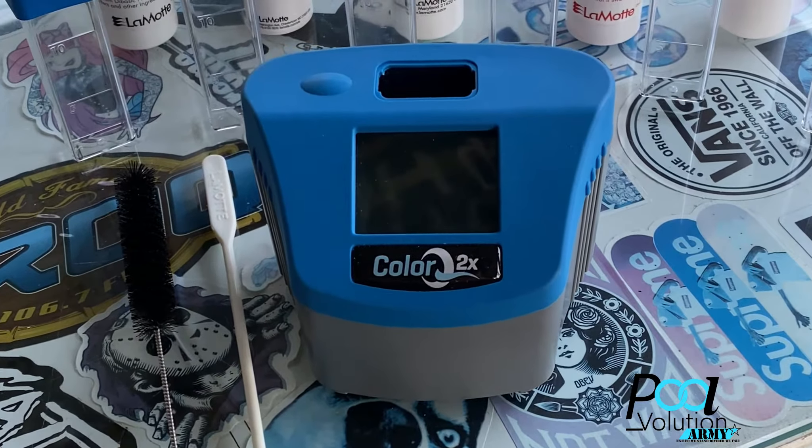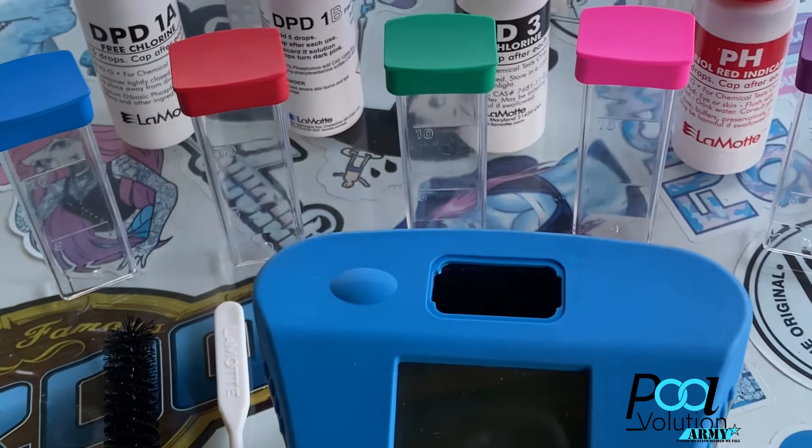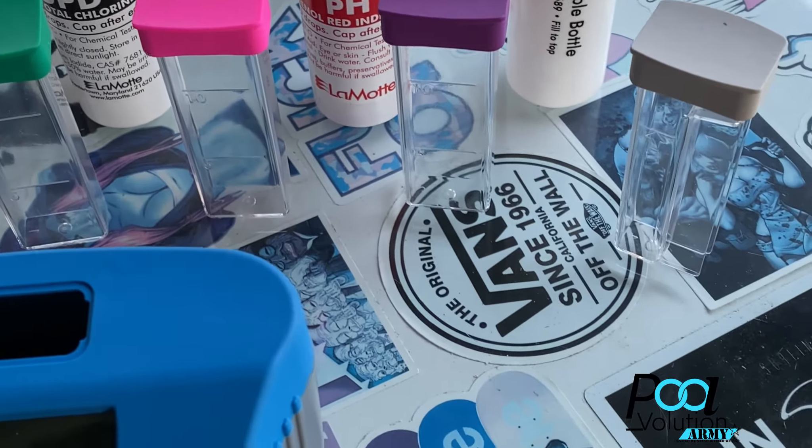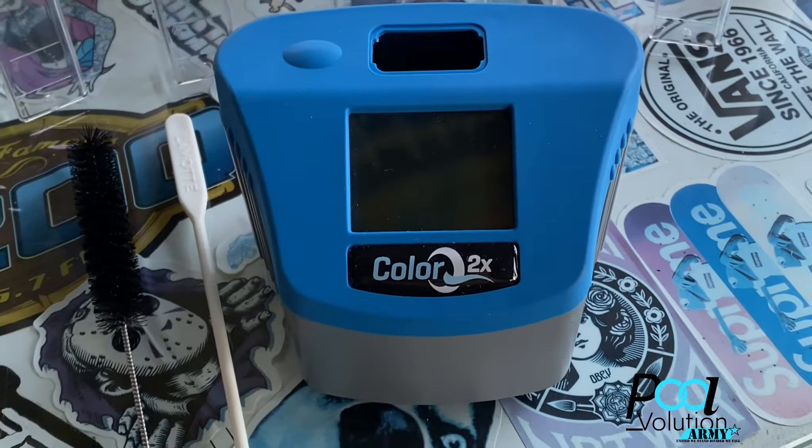What you get is some tablets, some reagents, some vials, a brush to clean the vials, a tablet crusher, and the photometer.